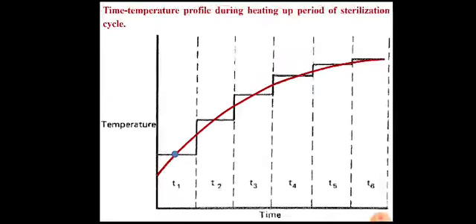This temperature is recorded, the midpoint temperature. So this is recorded for T2, midpoint of T2 and the corresponding temperature like this, and so on. For each time increment, the midpoint time and its corresponding temperature is considered.